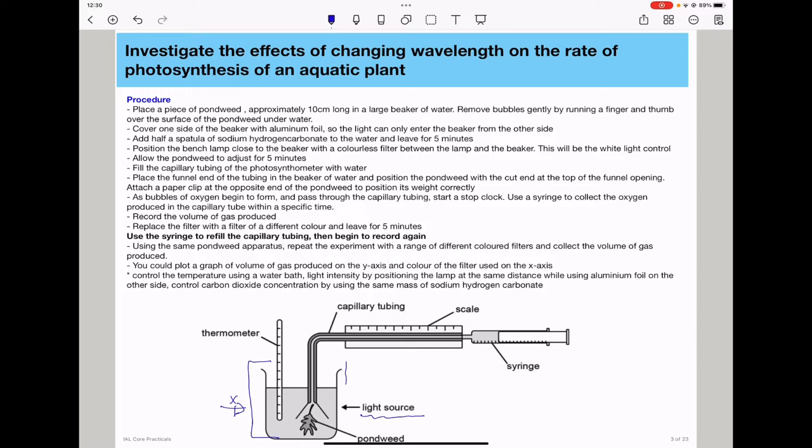We also put a specific filter in between the light source and the experimental setup so that we can control the wavelength. Remember, there are many colored light filters that will provide a specific wavelength based on the experimental setup. So my procedure is as follows.